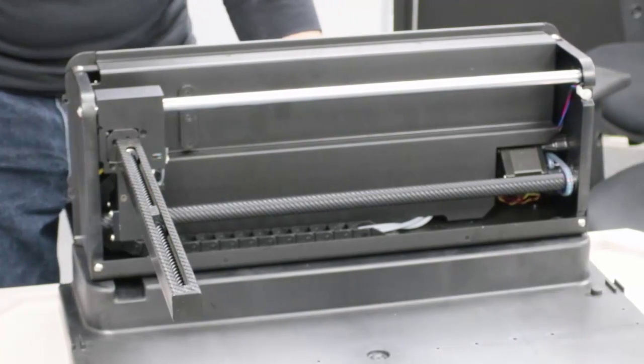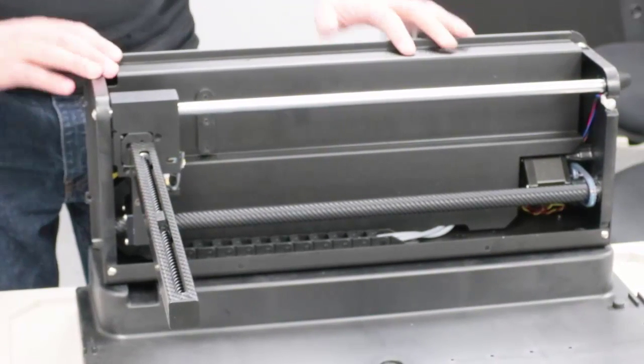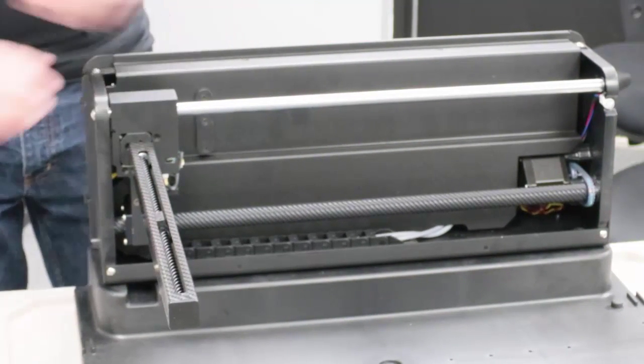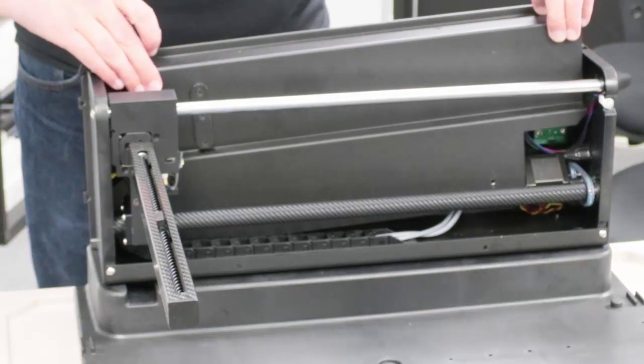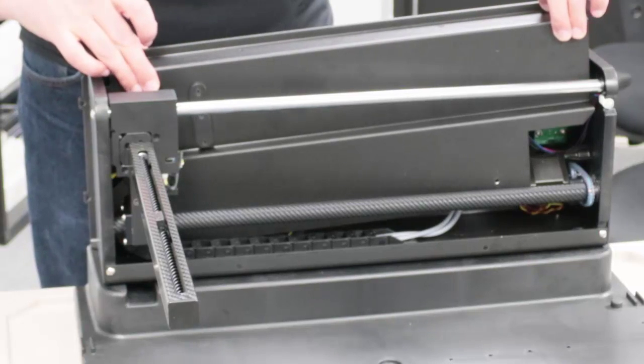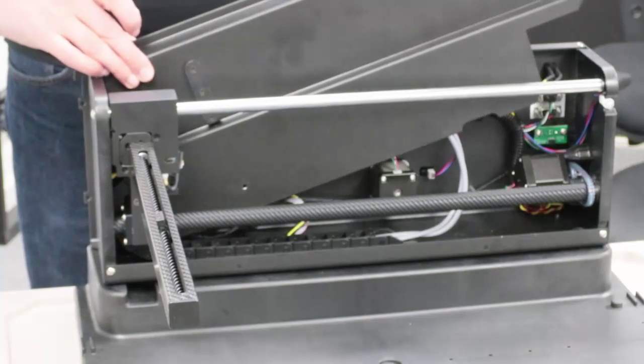The best way to get the splash cover off is to move the Y arm all the way to the left. Then lift the cover up slightly and to the side, then rotate it out in that direction.